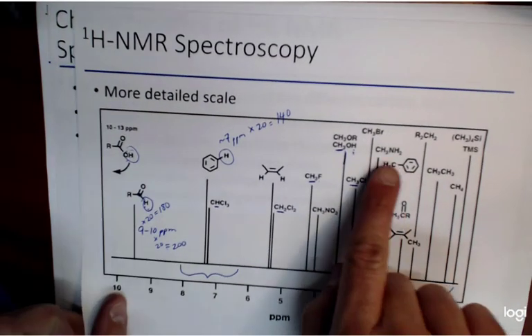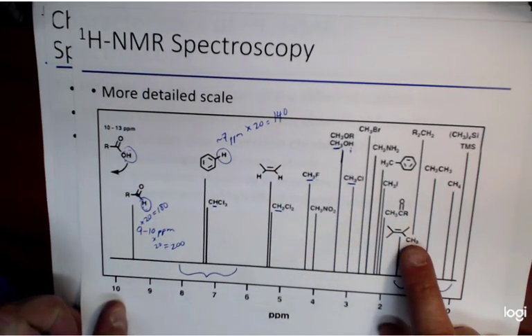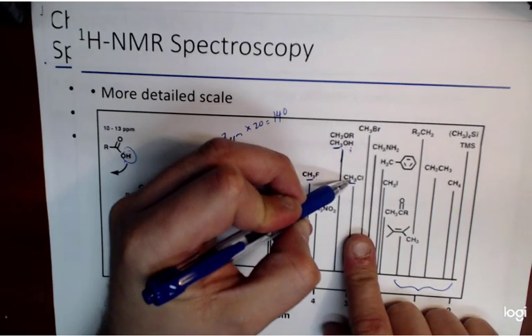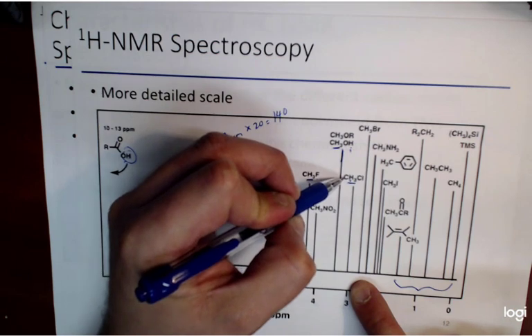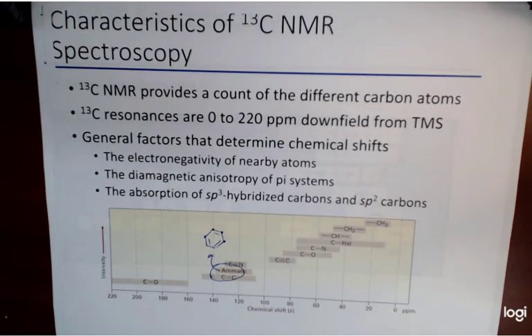So if you have a roundabout estimate of where these are going to be, then just multiply the hydrogens. So like that hydrogen, that's the signal at 3 for that hydrogen. So the carbon would therefore be at 3 times 20, or 60. Okay. All right. So don't fret about trying to memorize a whole bunch of stuff. All you're going to do is stress yourself out.